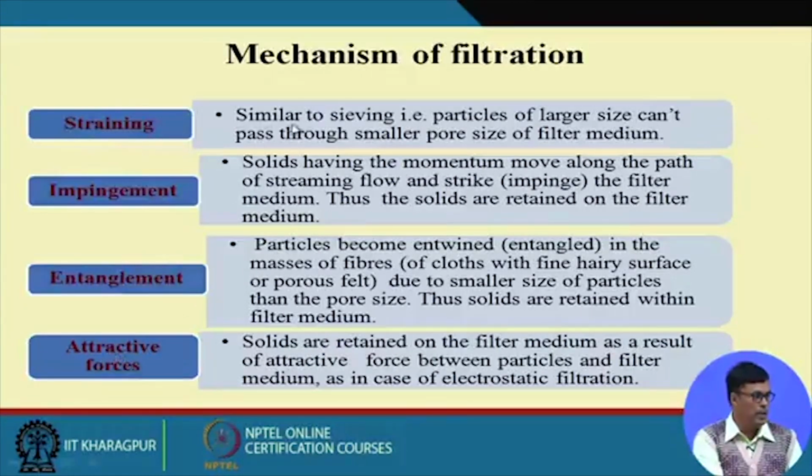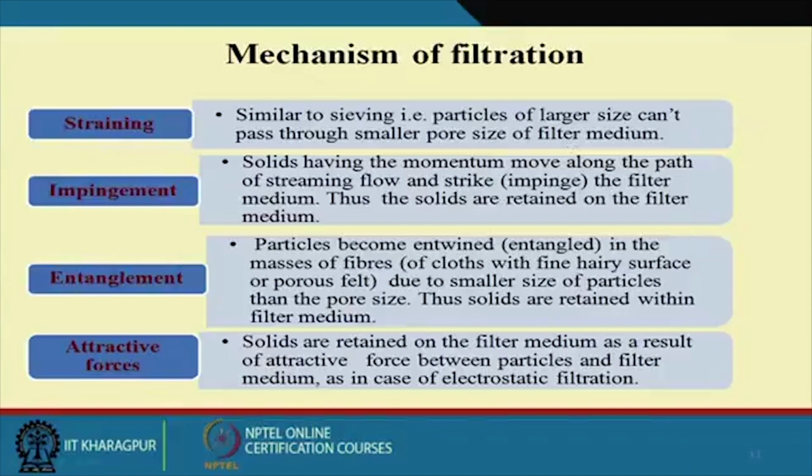Straining is similar to sieving, where a particle of large size cannot pass through a smaller opening. In some lecture I mentioned sieving, like 10/20 mesh, 20/30 mesh, so we have different pore sizes.